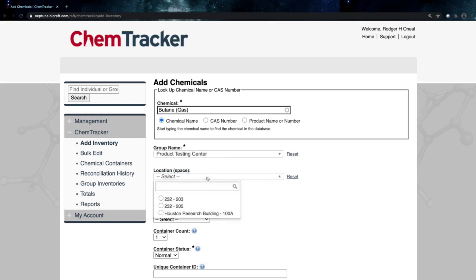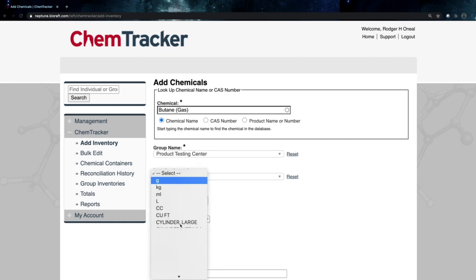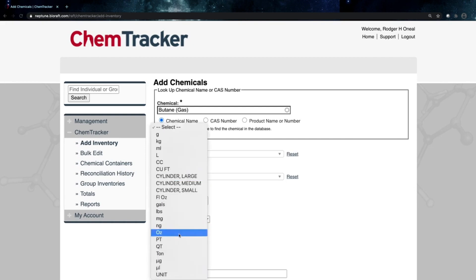From there, I'll select the room where this chemical is going to be stored. We're going to store it in room 205, building 232. We're going to enter the size of the container. This was an 8-ounce can. So we'll go ahead and enter those units in here.